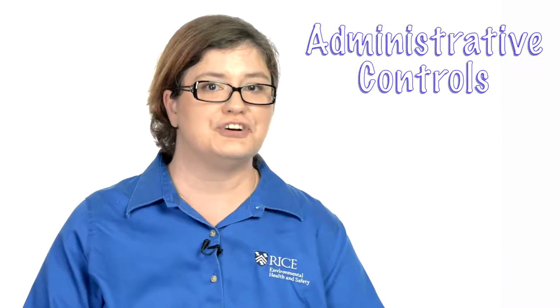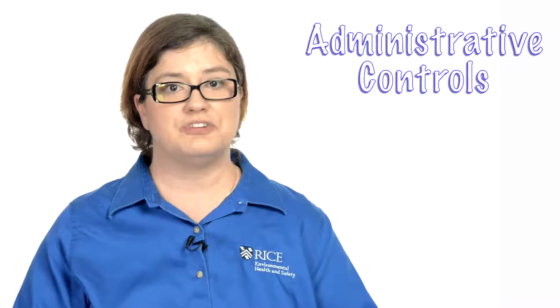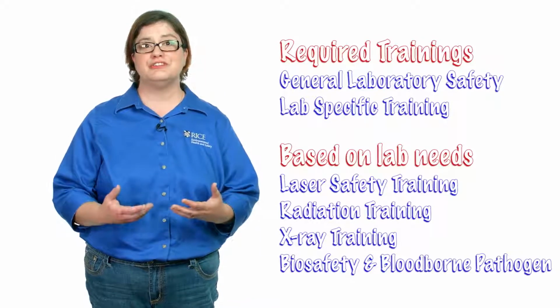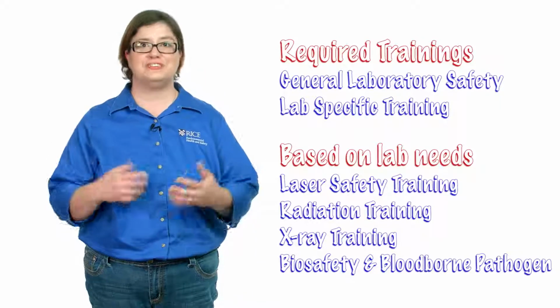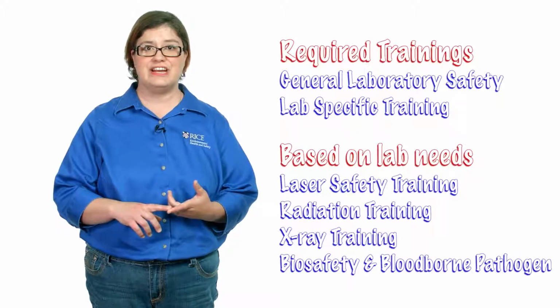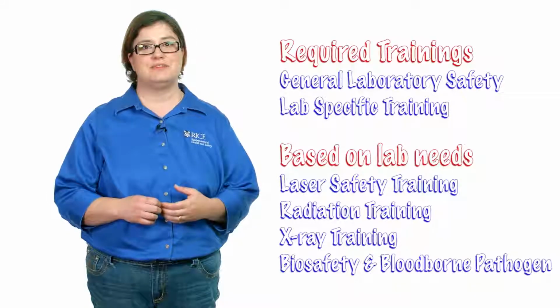The second kind of control I want to discuss further are administrative controls. This includes the use of more training and standard operating procedures. Some of the required trainings that you'll need to take are available from the EHS office. This includes general laboratory safety, which of course you're taking right now, biological and bloodborne pathogen safety training, laser safety training, as well as radiation safety training.